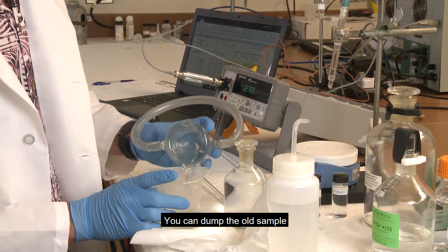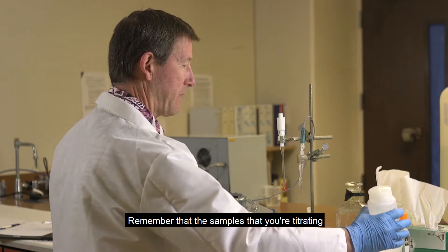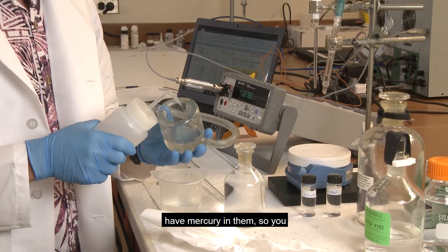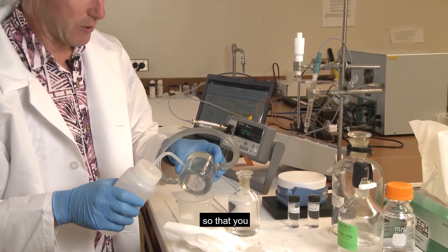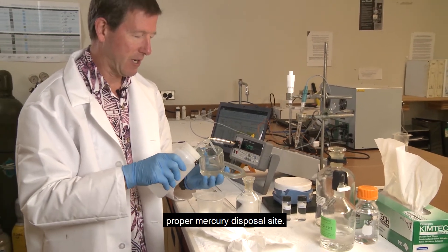You can dump the old sample in your waste container. Remember that the samples that you're titrating have mercury in them, so you want to save all of your waste so that you can put it into a proper mercury disposal site.